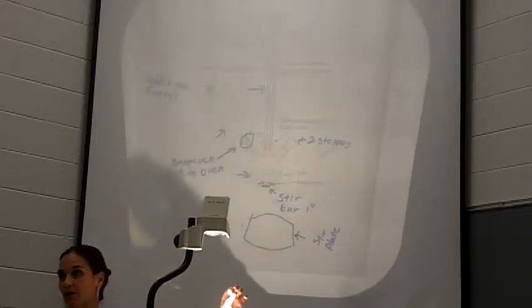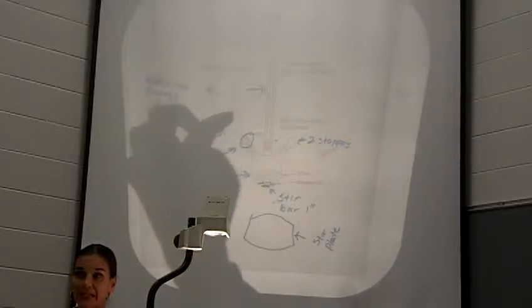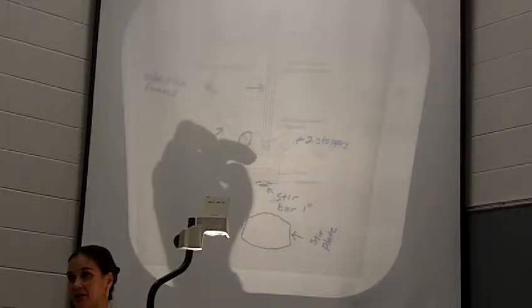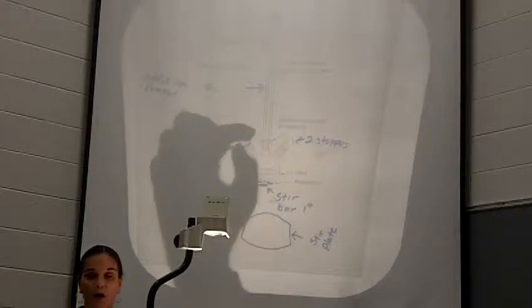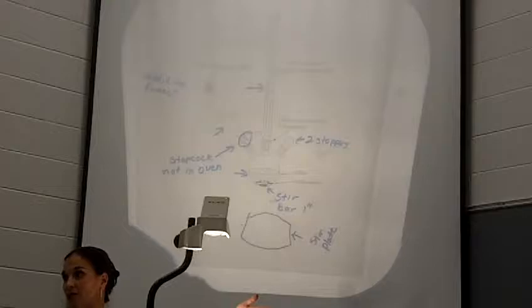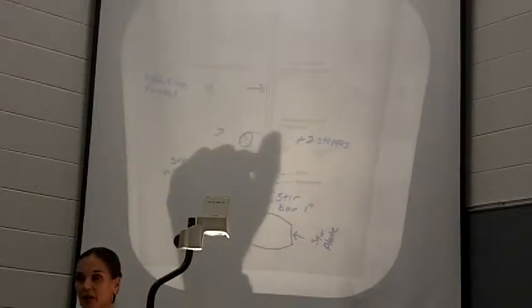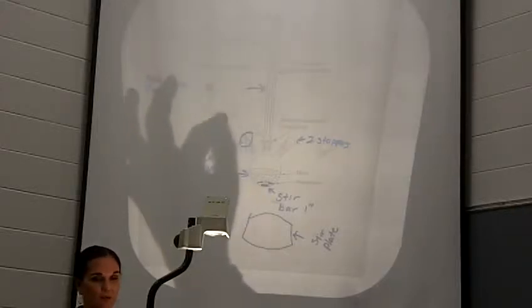What you do not want to do is put your alkyl bromide in here neat and have it all add to your magnesium all at once. That will be a super hot exothermic reaction that will not result in good things as far as your reaction is concerned, okay? Also, super hot exothermic things don't go with ether, which is a fairly flammable solvent, all right? So do not put your alkyl bromide all in here at once and have it add to your reaction all at once, okay? So that's why I say put the ether in first, then the alkyl bromide.